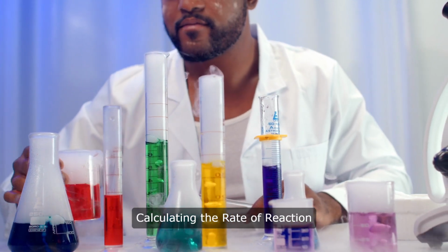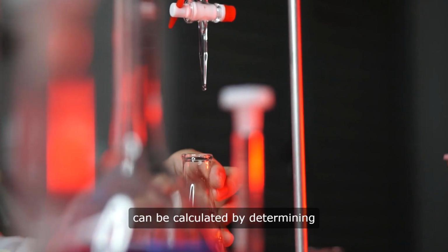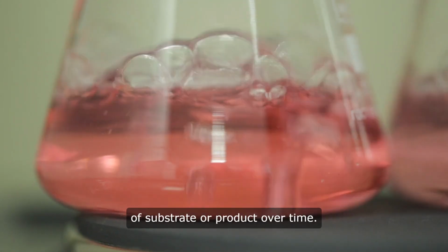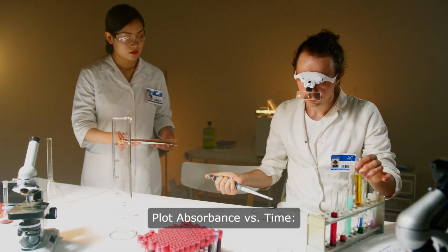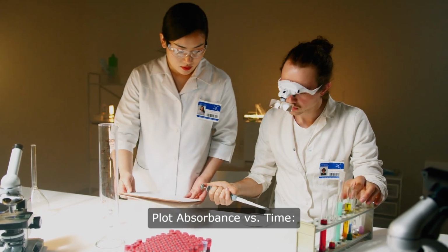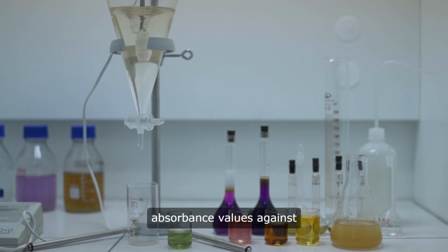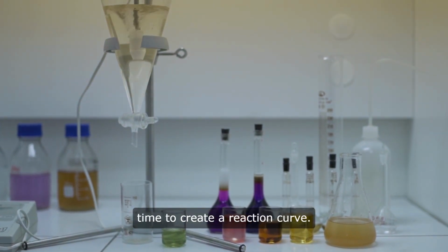Calculating the rate of reaction. The rate of an enzymatic reaction can be calculated by determining the change in concentration of substrate or product over time. Plot absorbance versus time. For each pH condition, plot the absorbance values against time to create a reaction curve.